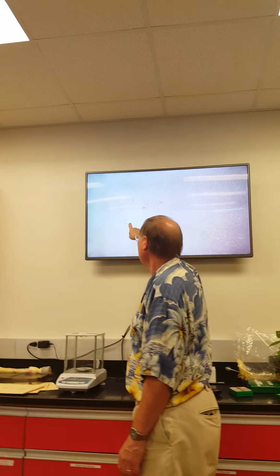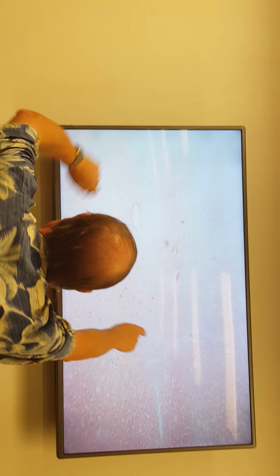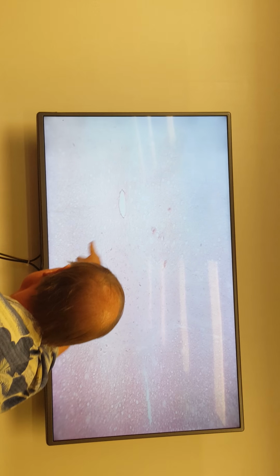I look at that hole, and then I start to see this dark material. This is light. That would be the gray commissure, which is what? Between the two halves of the gray matter. You can see the outline of the gray matter here. Now, how do I identify it?